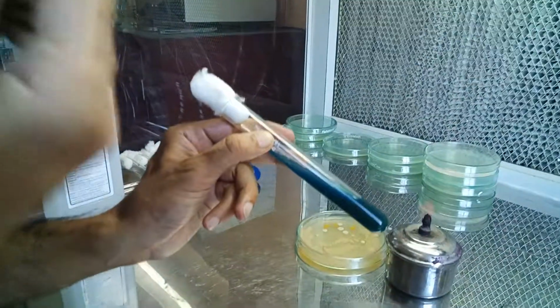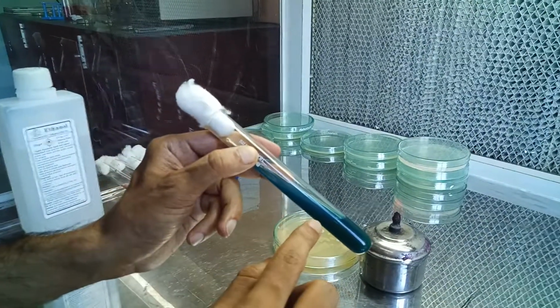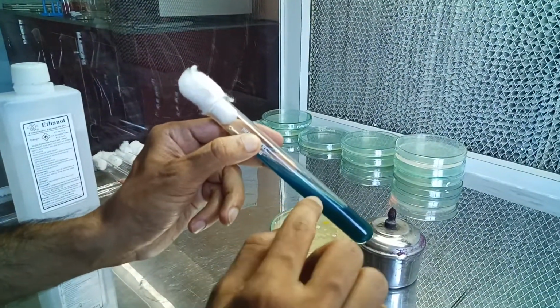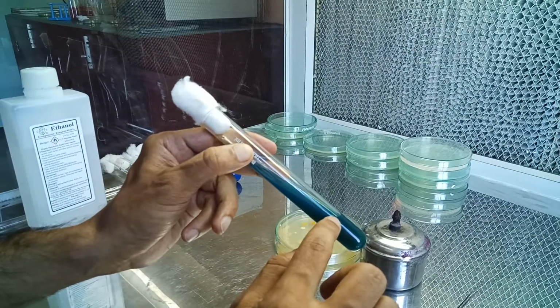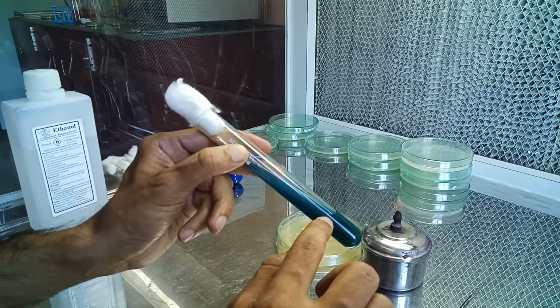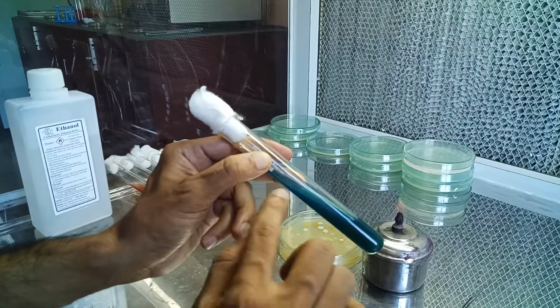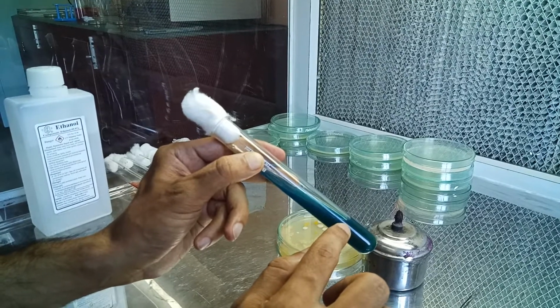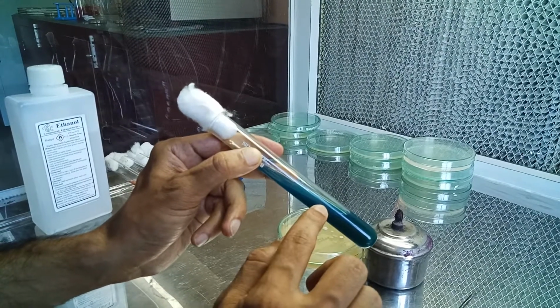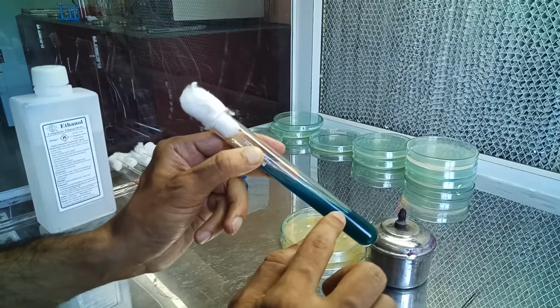So what is the principle? Citrate can be utilized by certain bacteria as the sole source of carbon. Once citrate is metabolized or broken down through intermediates of oxaloacetic acid, it produces pyruvic acid and carbon dioxide. The carbon dioxide produced thereby reacts with sodium and water from the medium, and it produces sodium carbonate.